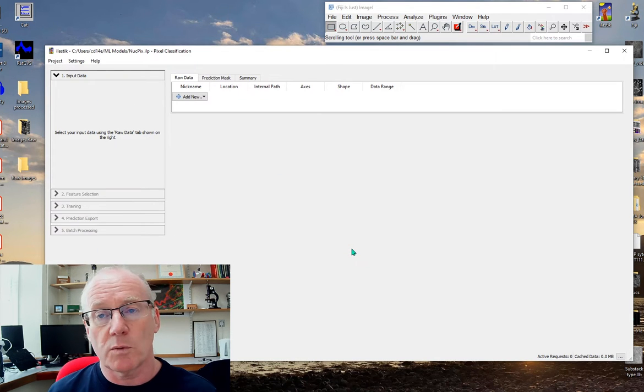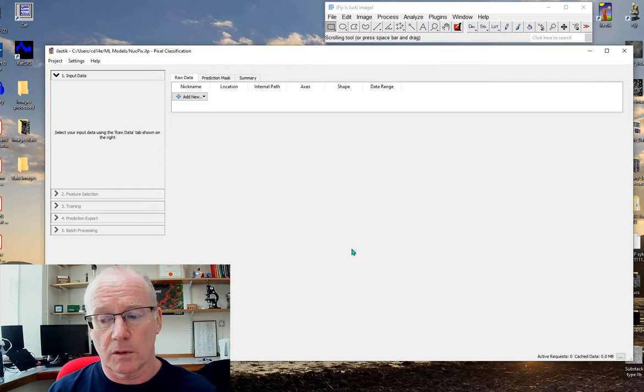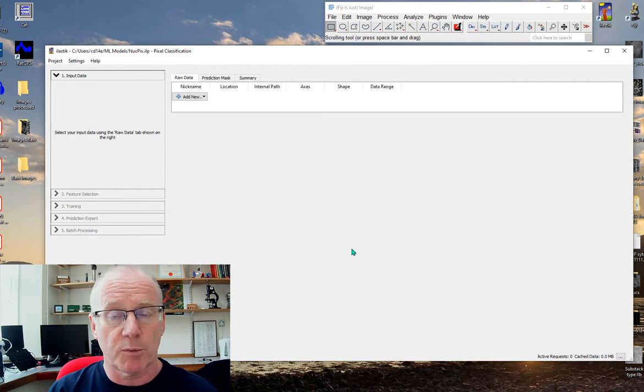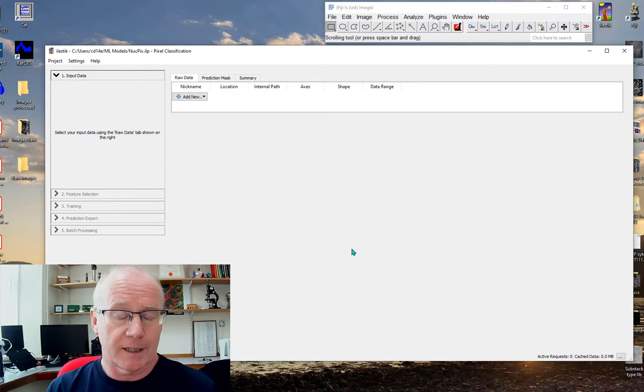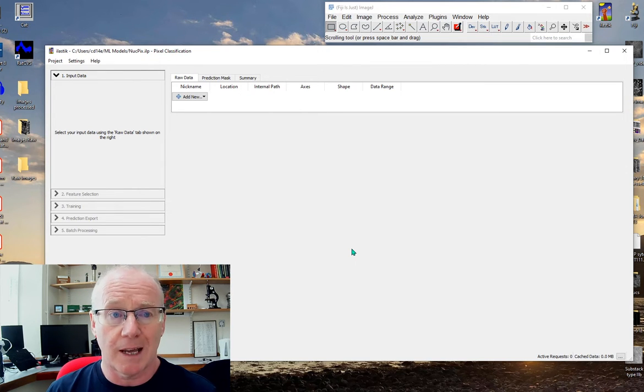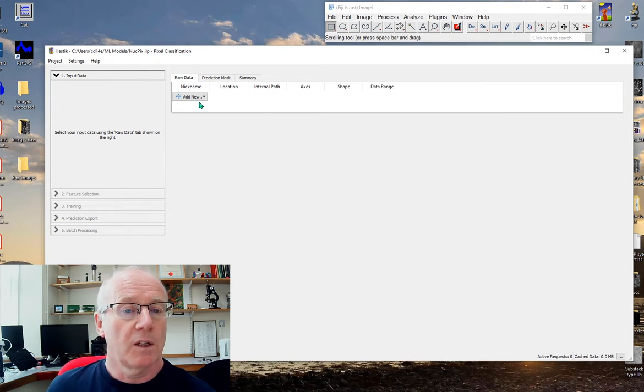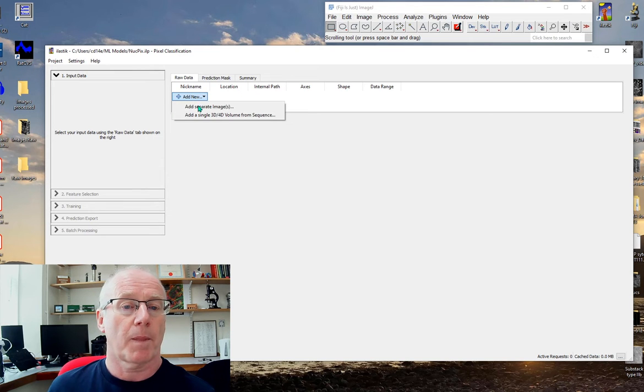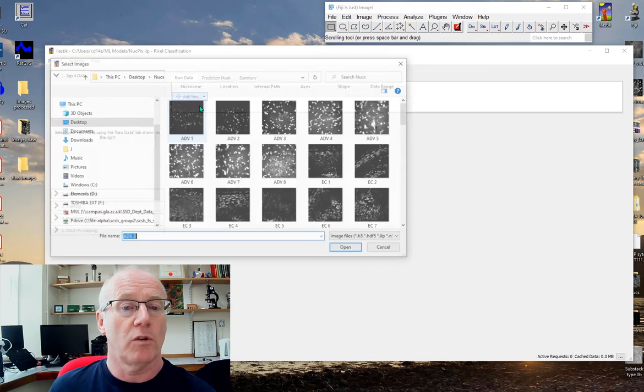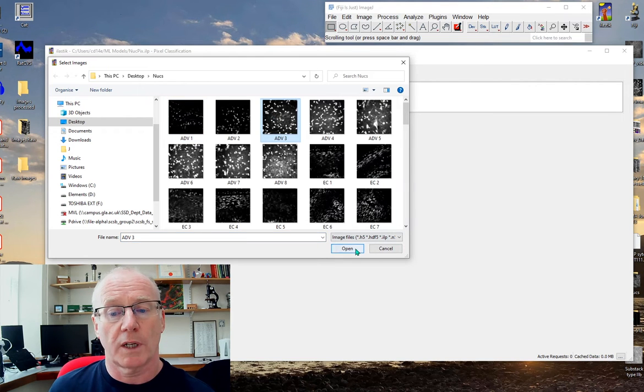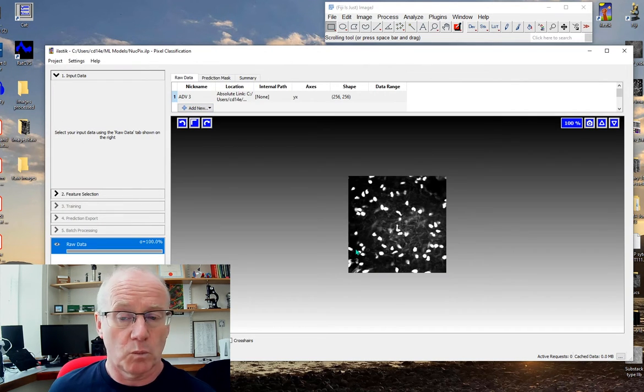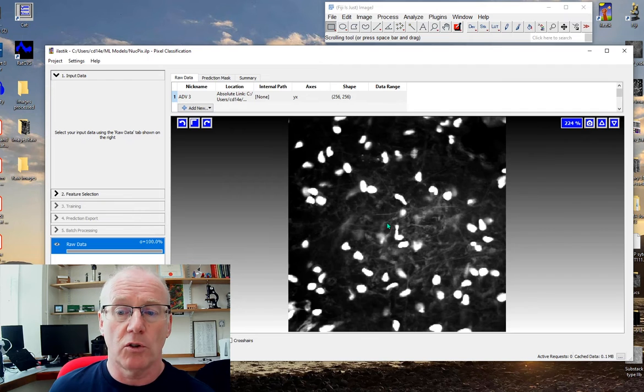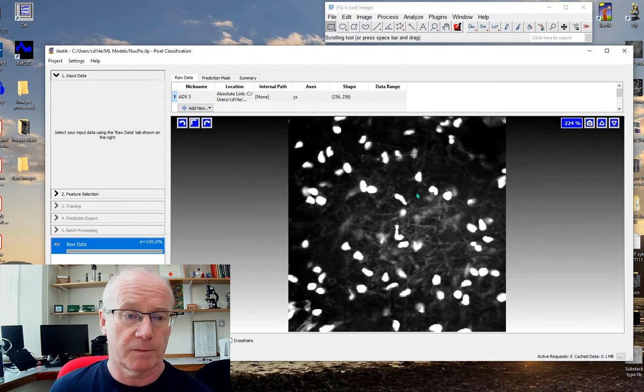Once we've completed this classification, when we save the project that project is in effect the trained network. Now we need to load in an image. Let's just take this one here. We've got an image which has bright nuclei and dark backgrounds.